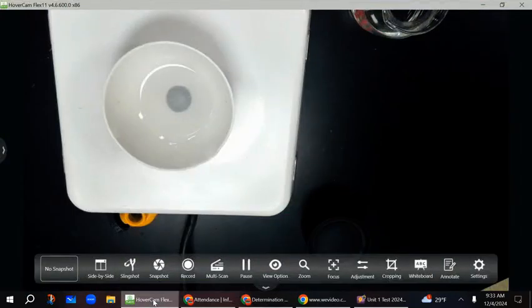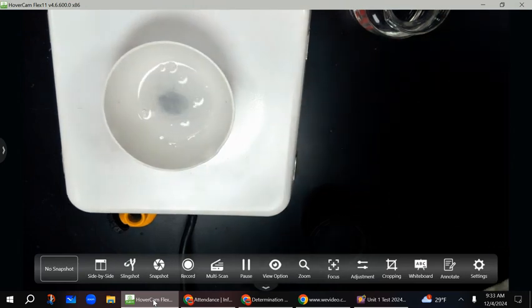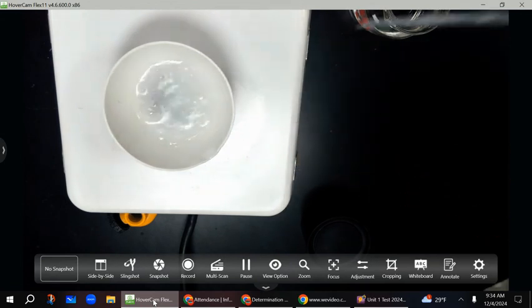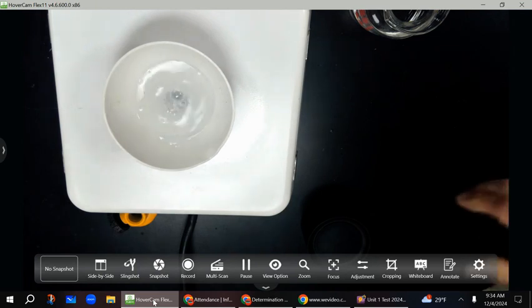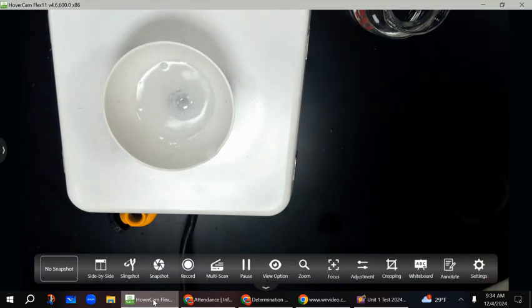By the way, this is not doing anything anymore, and there is still a bunch of silver in the bottom. So I need to add more acid to this to get that reaction to the point where all of the silver is gone. Okay? So even now, there's hardly anything going on. I would add more acid to it. Get it moving, get it going, get it along, because then once you start heating it, that's the last part of the experiment.